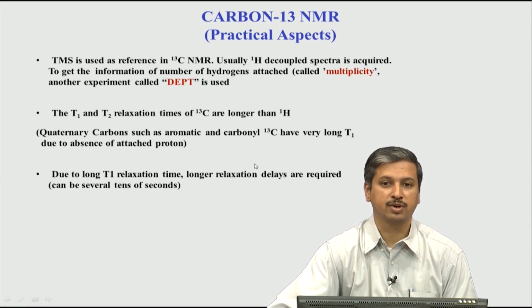But in the case of carbon, that cannot be done, because in carbon you have a much longer relaxation time, as written here. It runs into several tens of seconds, it could be 10 seconds, 20 seconds. So, in that case, if you want to use a relaxation delay, you have to use about 100 seconds, let us say a minute of relaxation delay, 60 seconds.